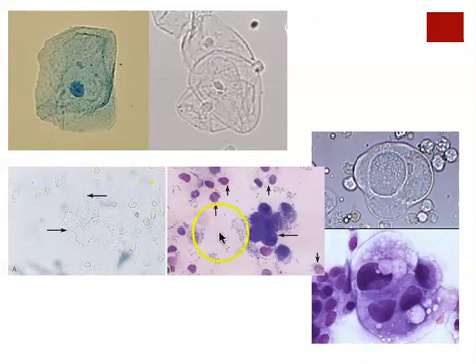Now, if you look over here on the right-hand side, you see the exact same smear of white blood cells that has now been stained. Again, these are eukaryotic cells. They have nuclei. They have particularly large nuclei for this particular type of white blood cell. And you can see there's some mass of cells over here that looks quite abnormal. These are actually cancerous cells.